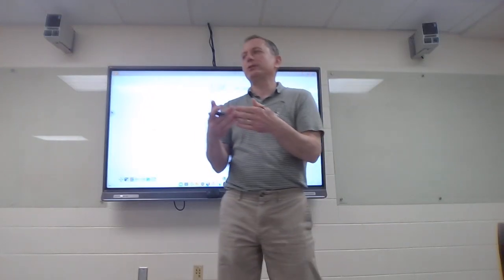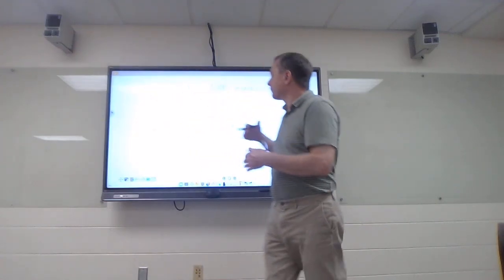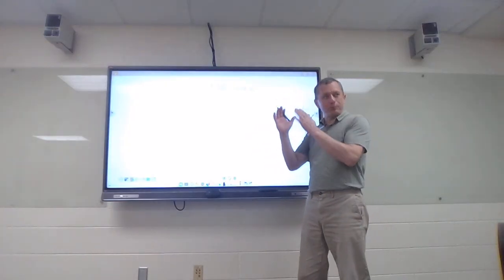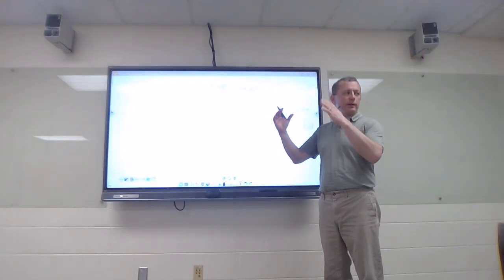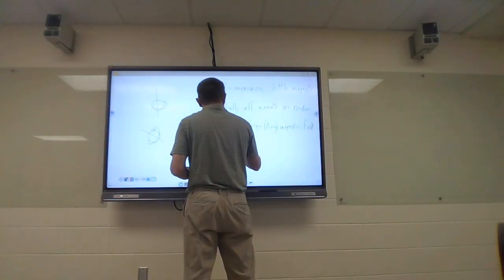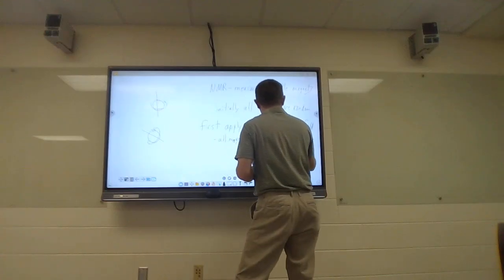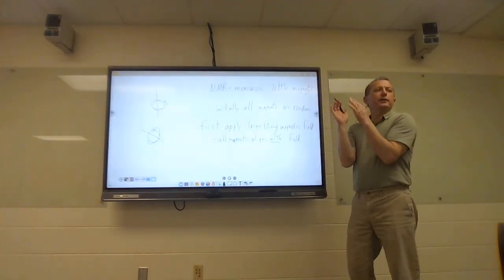So the application of a magnetic field, north-south pole kind of magnetic field, relative to a bunch of little magnets, all these little magnets are going to want to do like the little dog magnets, and they're going to want to line up with that magnetic field. This is bigger, stronger, and so when that's applied, all the things that were once random, all the little magnets then align with that large magnetic field.